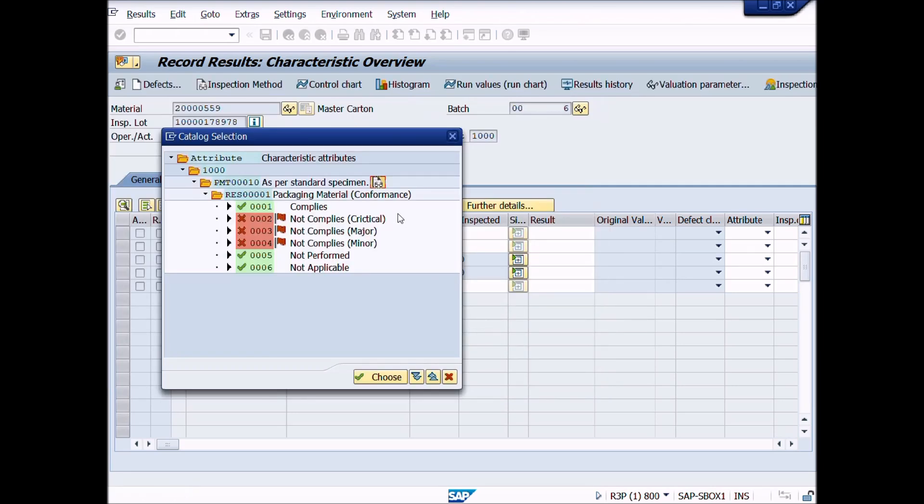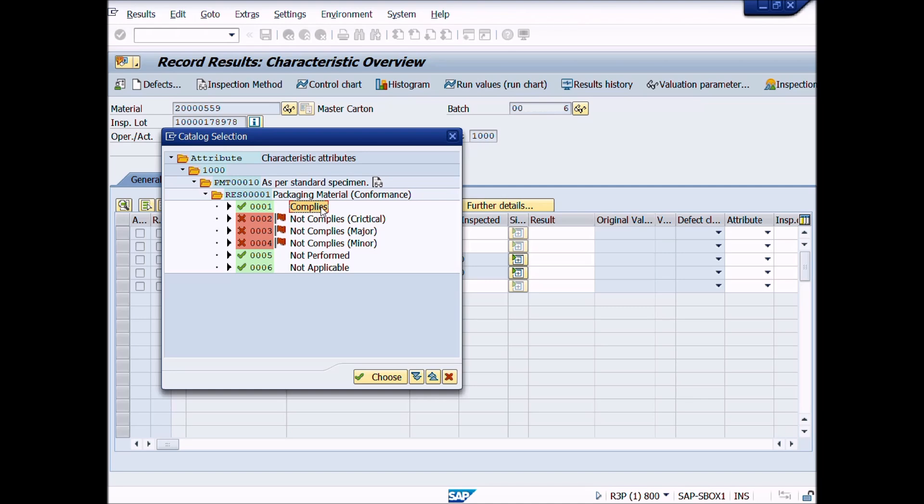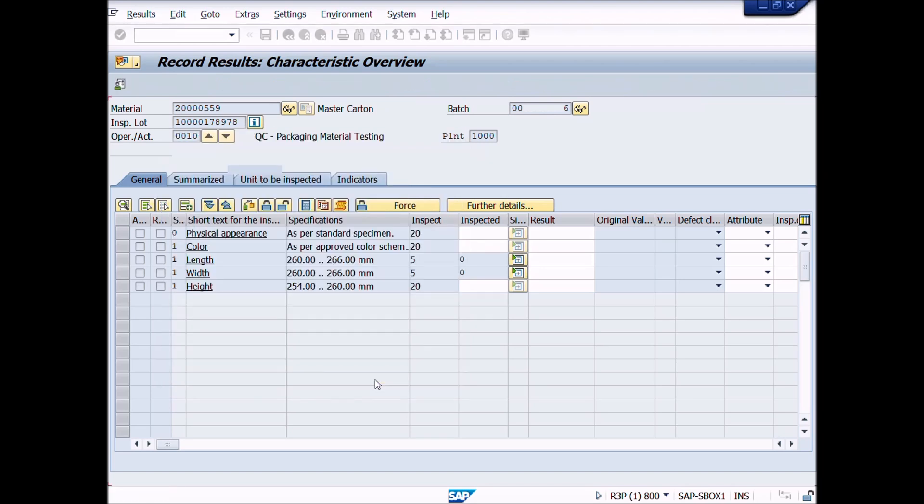Now on the basis of this selected set or specification, we will comply or not comply the result. If this test meets our specification, then we will choose complies by selecting this and press continue button or double click on this description. Then press enter button from your keyboard.